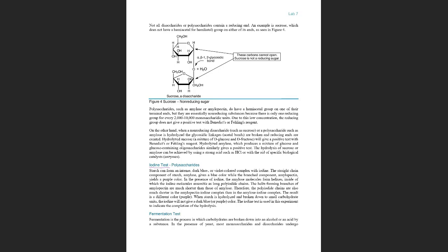Starches are formed mainly from a mixture of amylose and amylopectin. The amylose is about 15%. They form like a little coil, so the iodine will get inside and produce that blue-black color.